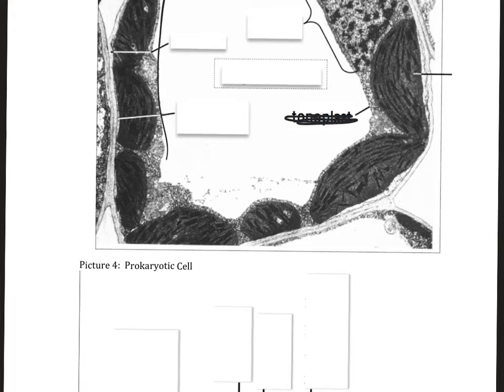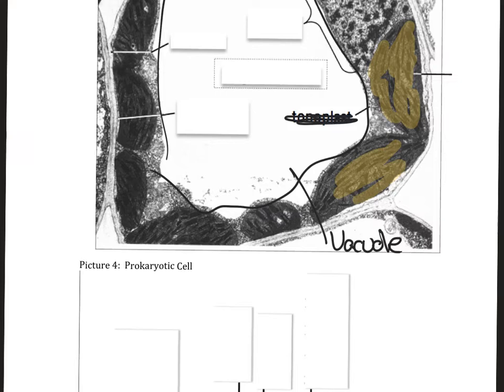So the first thing you notice is this big wide area here, right? That's the vacuole. And then here, if you notice, those are chloroplasts, okay? Those are chloroplasts. And again, they have the little pancake structures there. So if you look over here, these are chloroplasts also.